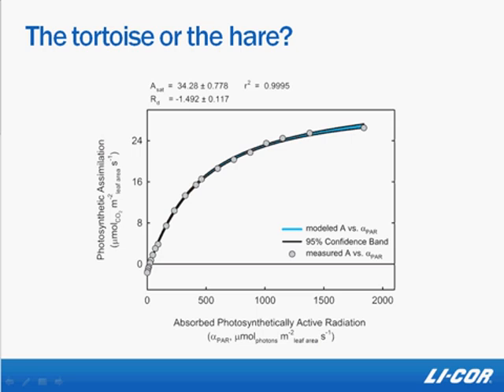Remember that your research question will direct the way you do a light response curve as well as the points you set within it.